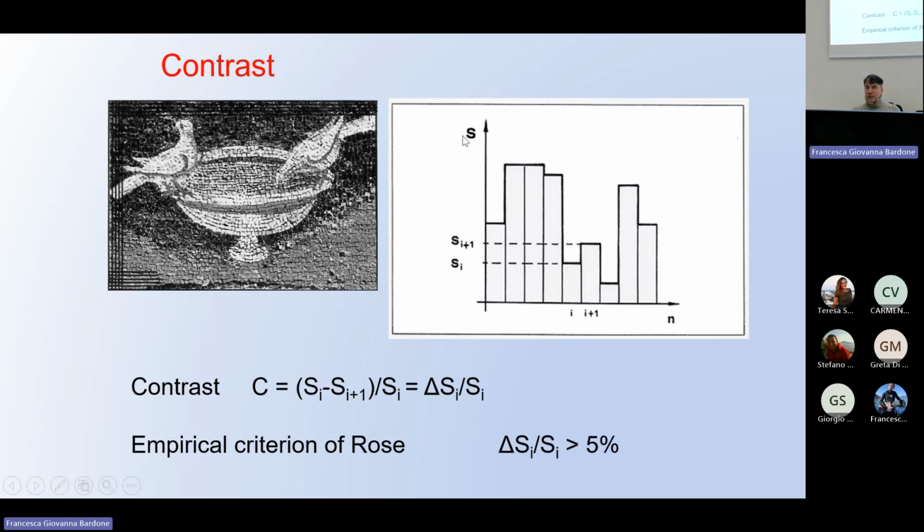I put it just generically as the signal. If I have pixels, every pixel has a signal. Here this is the signal of one pixel, this is another one, the same signal, a little bit less, much less, different quantized steps of your signal.